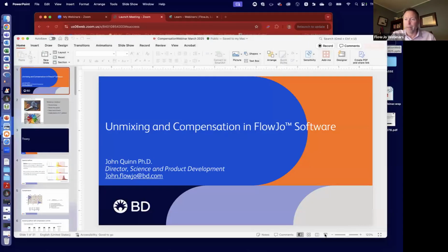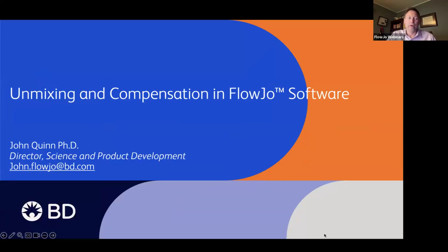All right. I am going to share my screen. And we'll get going here. All right. So here we go. Unmixing and compensation in FlowJo software. I am going to make sure that I have the chat turned on so that I can see any questions that pop up, and I'll try to answer them in real time as we go through.